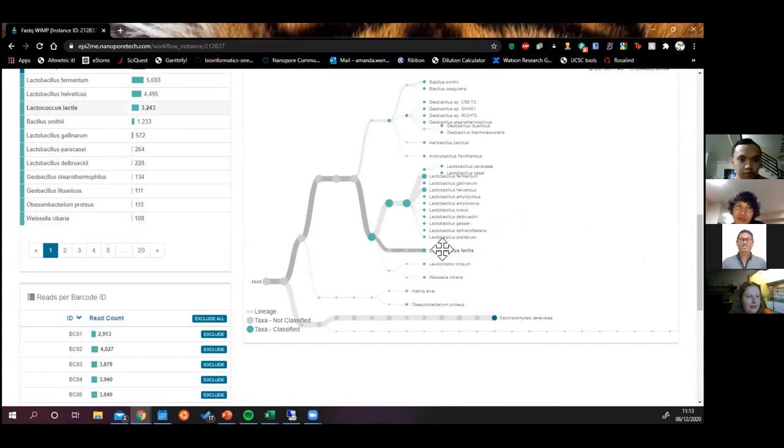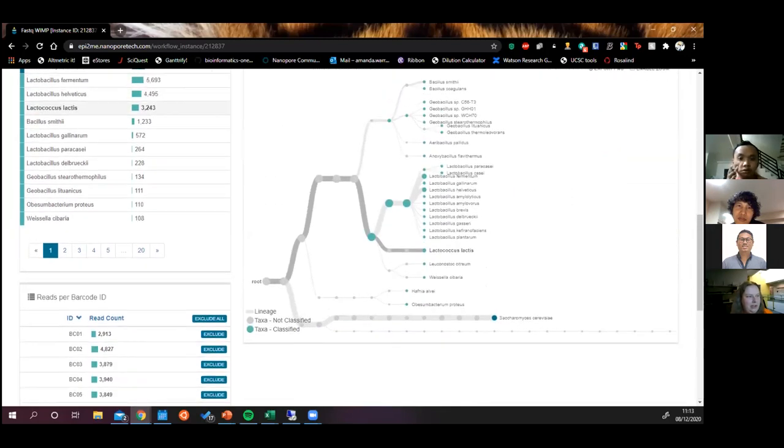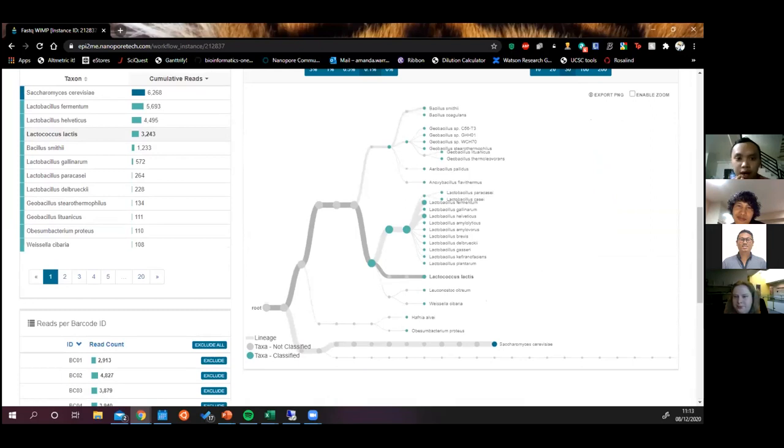It is quite nice though. I mean, it's very user friendly. You can click on it and read some information about the species. I'm interested how they do the classification. Is it using Centrifuge for sequence similarity, or do they have a certain algorithm? It's using Centrifuge, the classification tool called Centrifuge. You can look into how that works. It's basically just a very, very fast classification tool. This is probably not what you want to publish. You probably want to use something with a more extensive database and a more accurate classifier. This is a little bit gimmicky, but it will work for people who are completely allergic to bioinformatics.